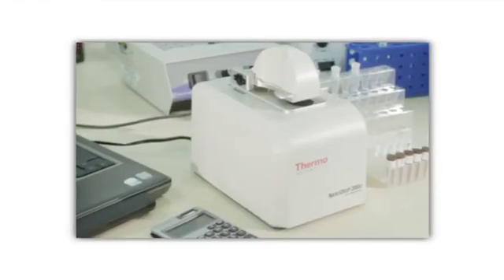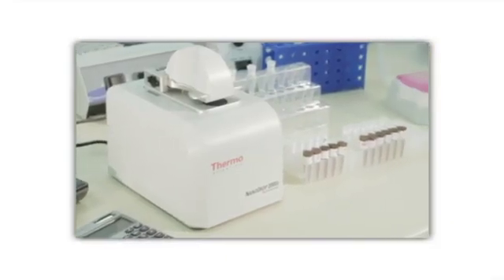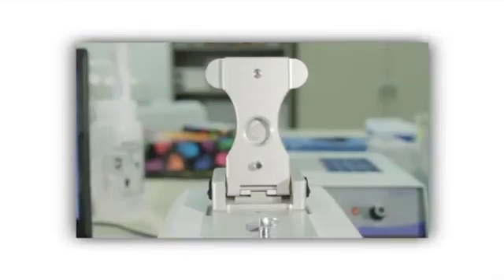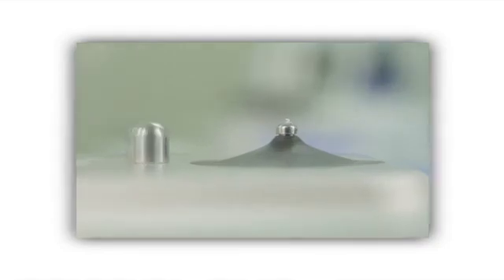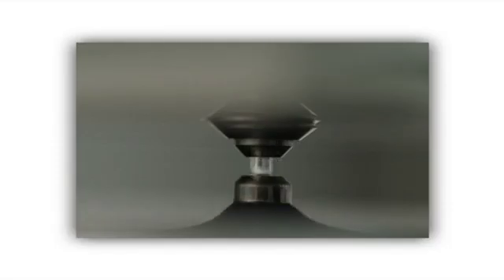The Nanodrop sample retention system is innovative technology that uses the inherent surface tension of liquids to hold and measure microvolume samples between two optical pedestals without the use of cuvettes or capillaries. As little as 1 microliter of sample is pipetted directly on top of the lower optical surface. Upon closing the spectrometer arm, a liquid column is created between the upper and lower optical pedestals by surface tension, forming a vertical optical path.